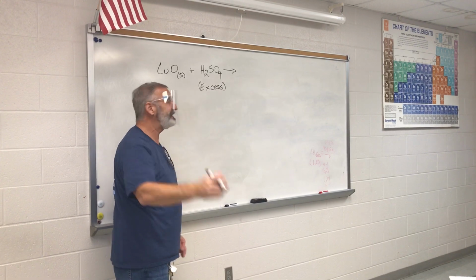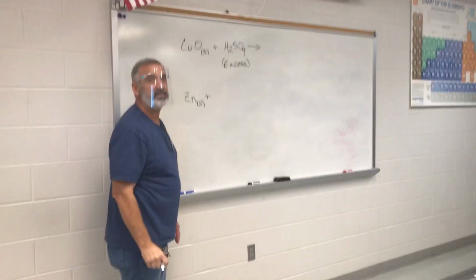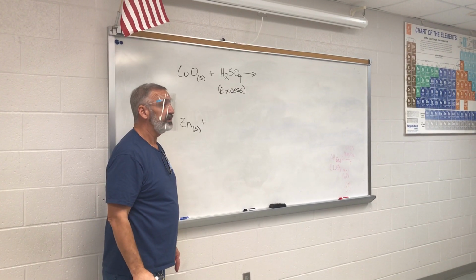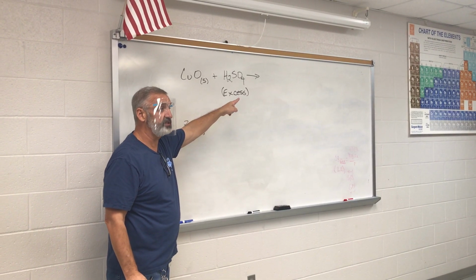So now we added zinc. What's the purpose of adding the zinc? To switch with the copper. In which compound? CuSO4, because that's the product that's being made over here. That's the blue solution, is the CuSO4.